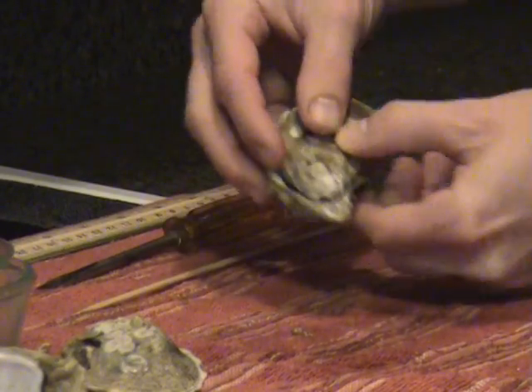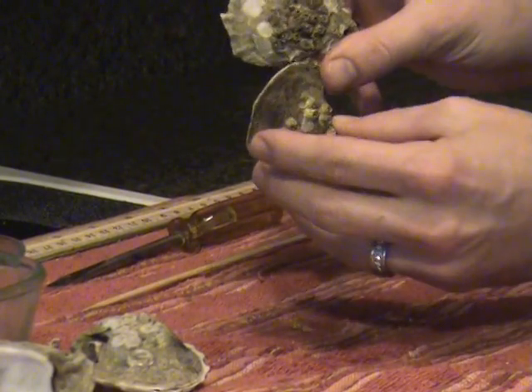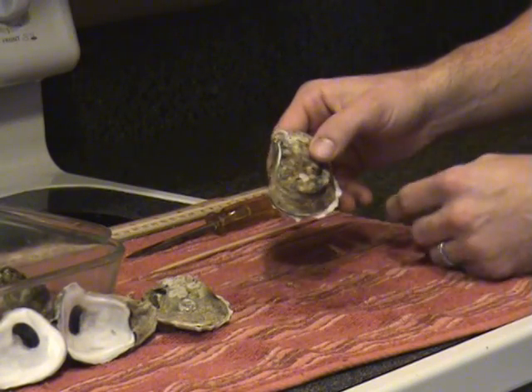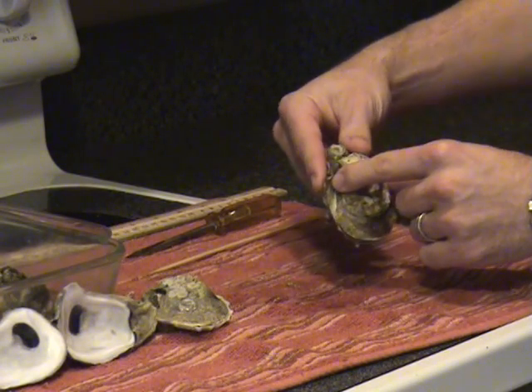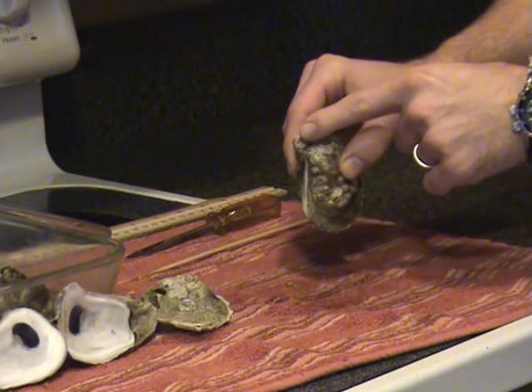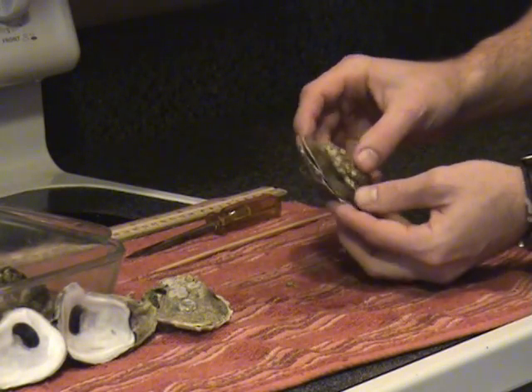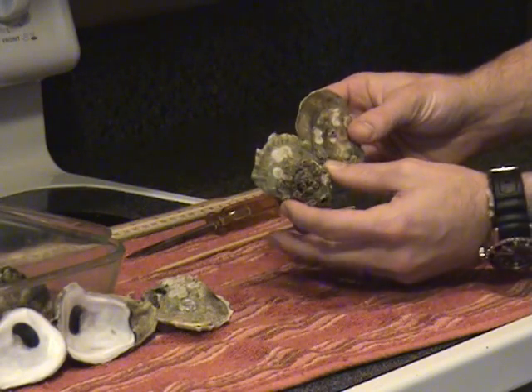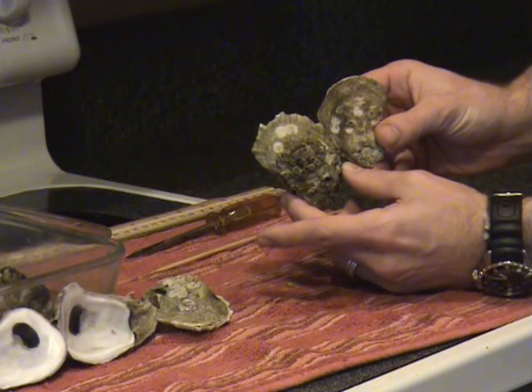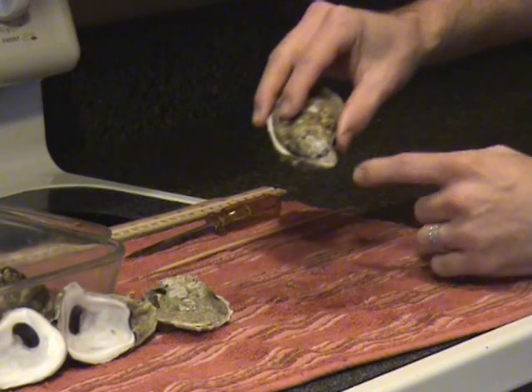Observe how the two valves fit together. The shorter of the two valves is the right valve. Notice how the umbo of the longer valve, the left valve, extends beyond the umbo end of the right valve. Typically, the right valve of an oyster will be shorter and less concave than the left valve. However, since the size and shape of an oyster can be influenced by its environment, observing the umbo end is the most reliable way of differentiating between the right and left valves.